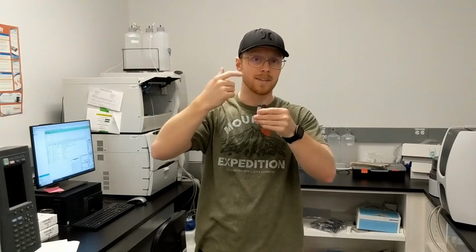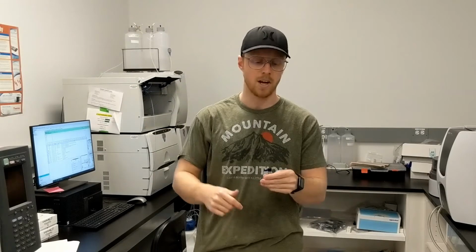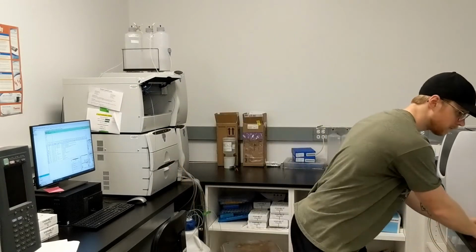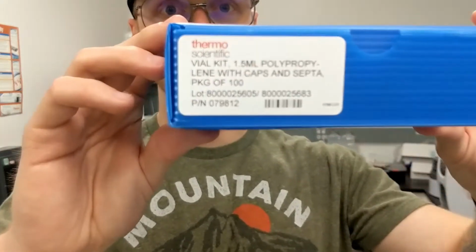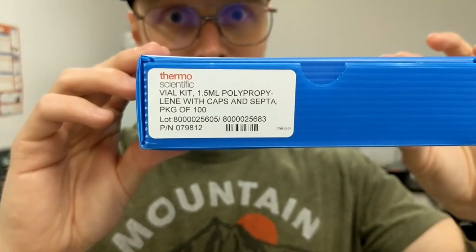When the needle is trying to inject your sample, it might bump into the top, even if there's just that small height difference, or it might miss the hole if the hole is a different size. So make sure that you've got the right vials, and if you need those vials, here's the part number right here. You can pause the video and order that if you need it.